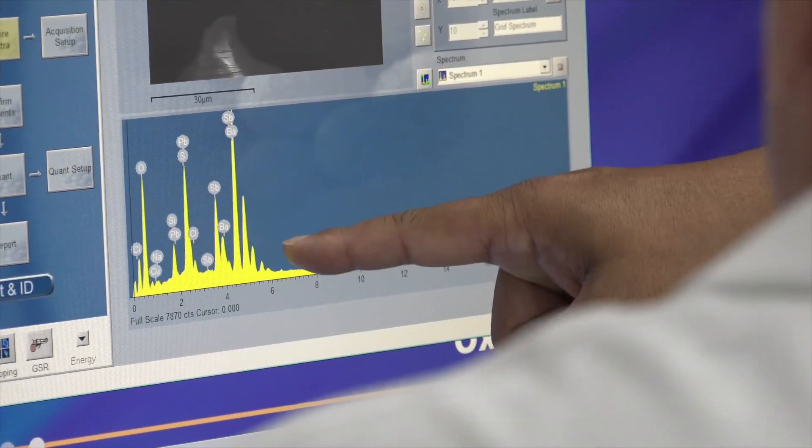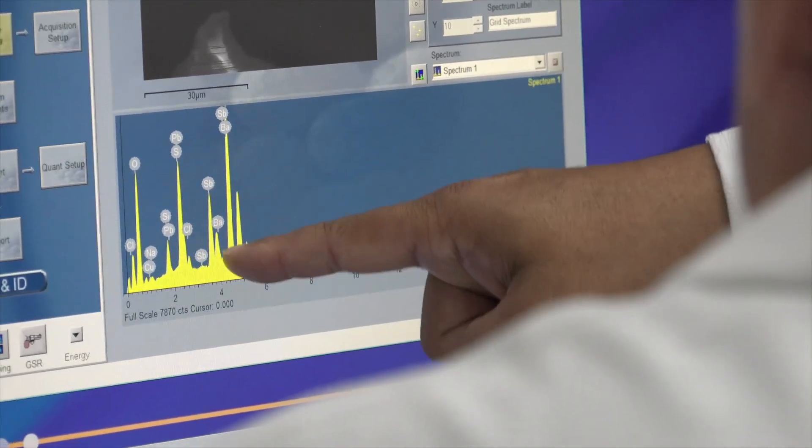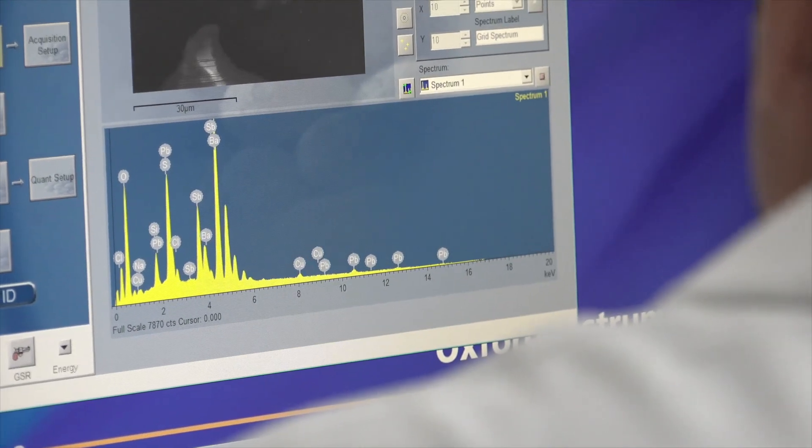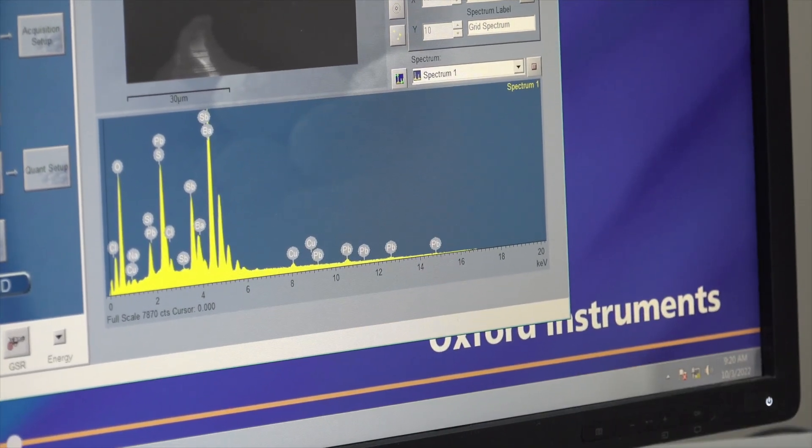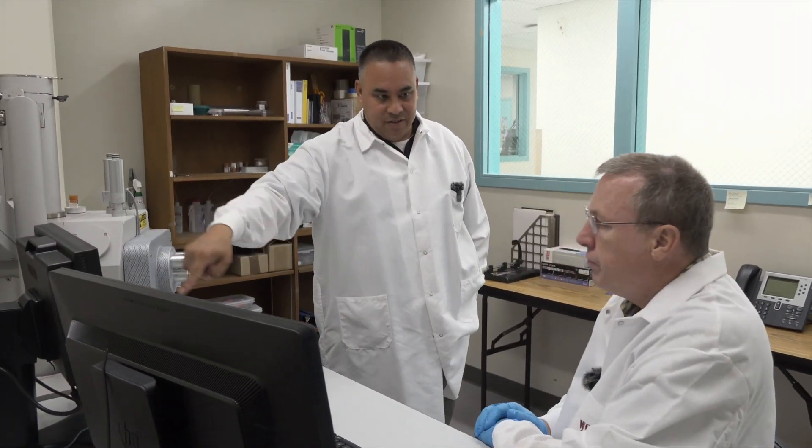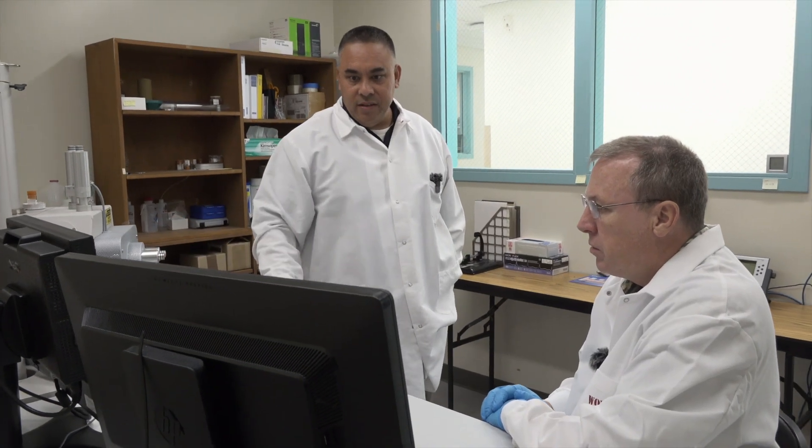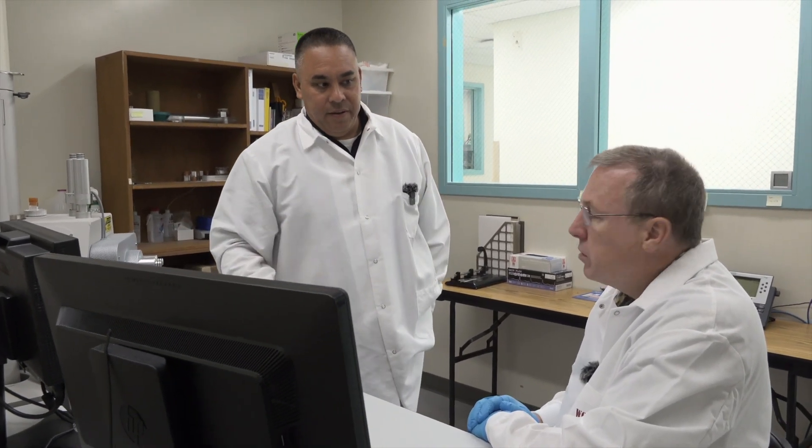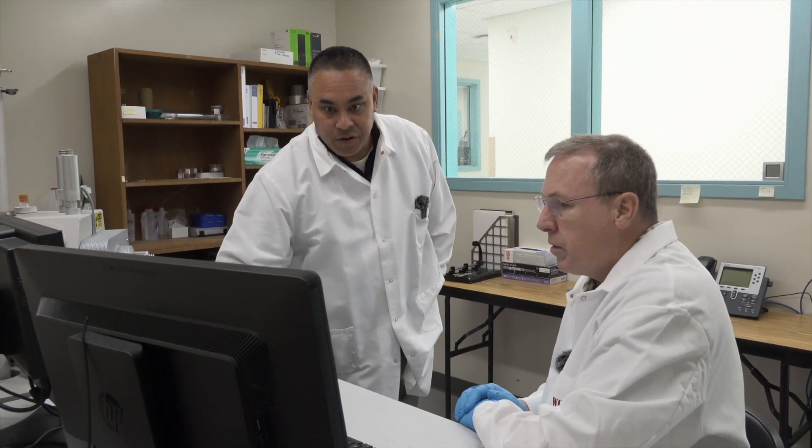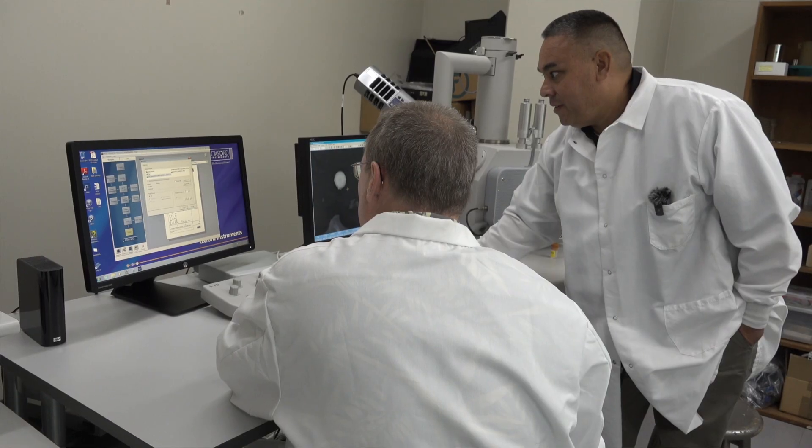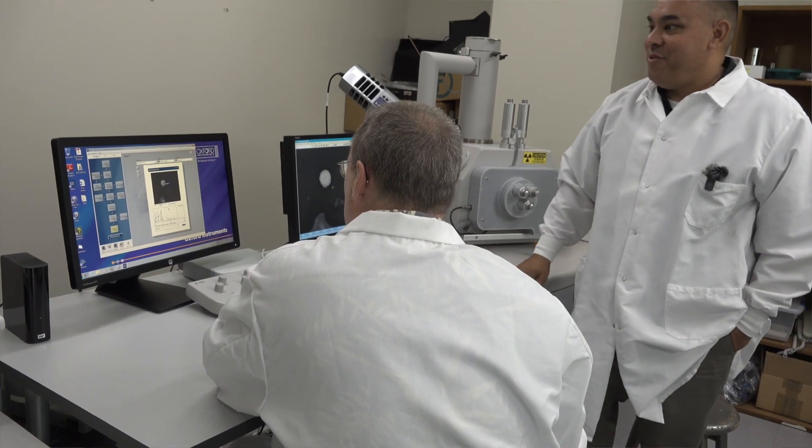Barium here and antimony there. So what we're looking at here fits our criteria for a gunshot residue particle. It's got that spherical shape. It's got the elements lead, barium, and antimony. Okay. And then we'll just put this in our report. And that's how we find our gunshot residue particles.